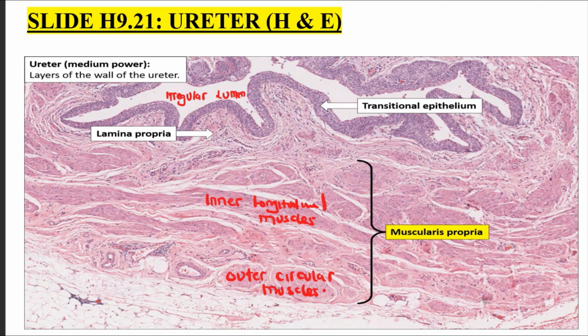It is made up of adipose connective tissue. You can see this is fat cells. And then you've got the arteriole here. And then these here, the irregularly shaped, these here are venules. So this is the ureter.